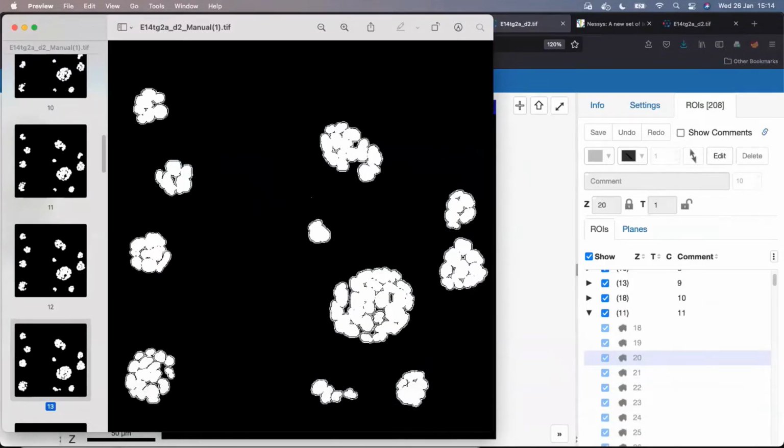The only thing, the reason for survival of this image and keeping it in the IDR, albeit on a little bit, as I say, not full citizen level, is that these are indeed the original data, processed data, nevertheless original in the sense that they were submitted and produced by the authors of the paper. Okay, so that's why they are there on that attachment level.